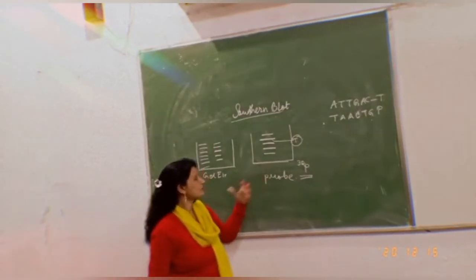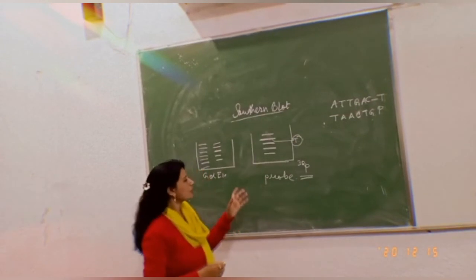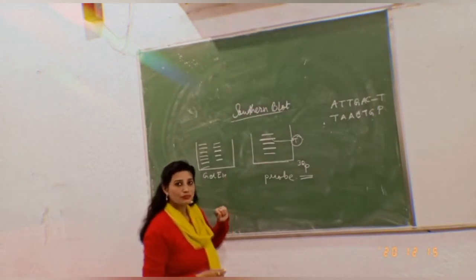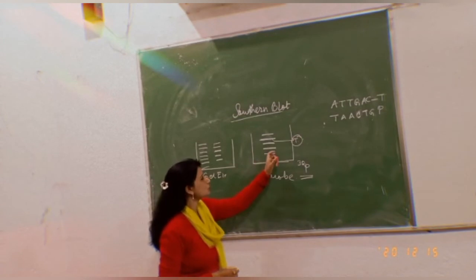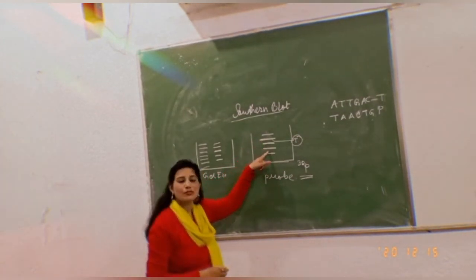But right now I am still facing one problem, in nucleic acid hybridization. I must exactly get this position also. And how to achieve this target? Right now, I have to use my probe. Probe is single stranded. Here, the DNA that I have got is double stranded.